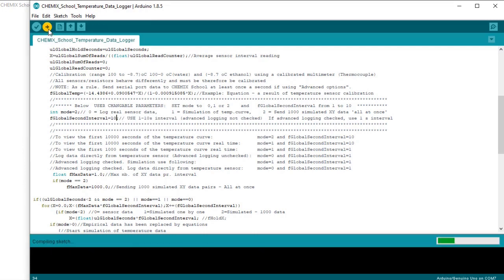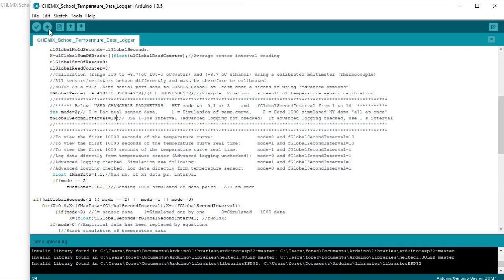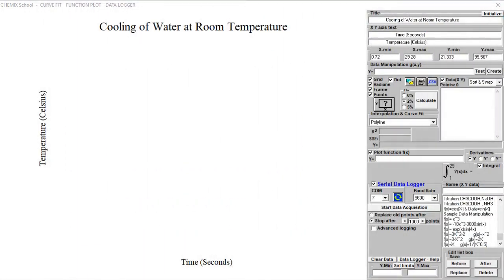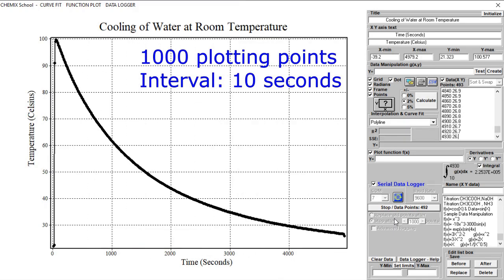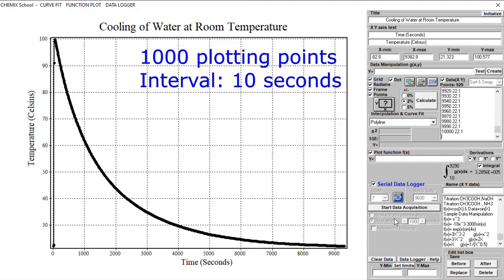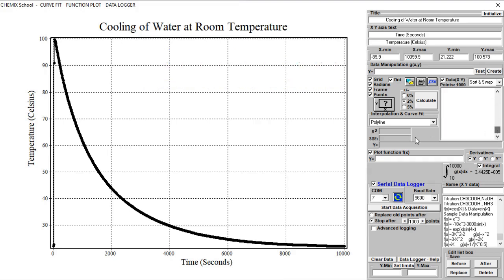To upload the sketch to the microcontroller, click on the arrow pointing to the right as demonstrated and wait until the sketch has been uploaded. Start data acquisition and wait until all the data has been received. As we can see on the left side above the data field, 1000 data points have been received. By scrolling the data field we can see that the time interval is 10 seconds.